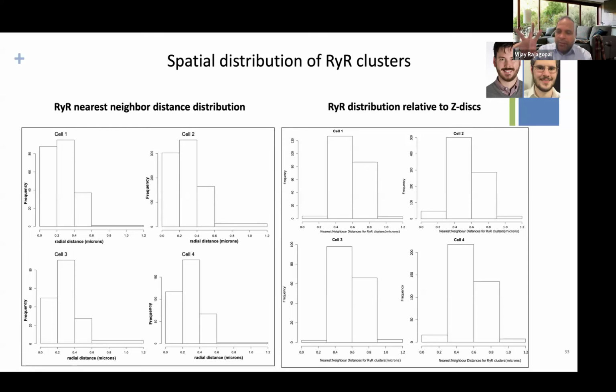That allows you to tackle the problem that you may not get the images all on the same tissue block. By collecting 5, 10 samples of these images and extracting the statistics, you can put a statistical distribution of the organelles that are in the confocal and simulate them onto your electron microscopy.